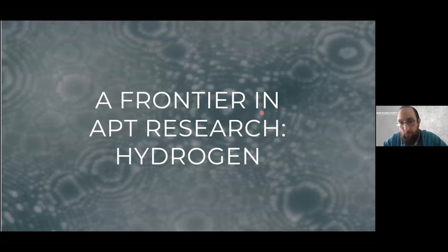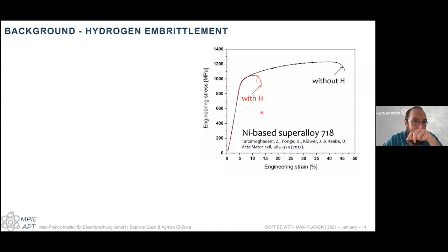So what we tend to do in my group is try to really push the frontiers in atom probe research. So here is where I'm going to start getting into hydrogen, and I'm going to lead to Ayman's talk. As I've mentioned before, hydrogen is interesting as a scientific problem, but it has a lot of engineering applications.